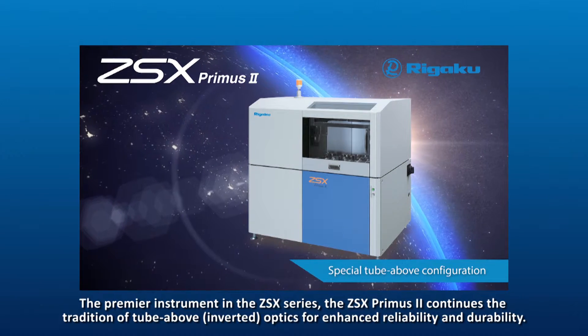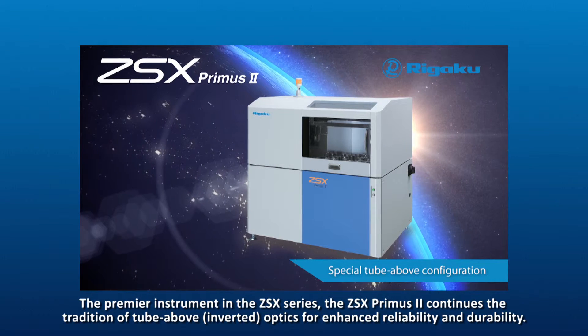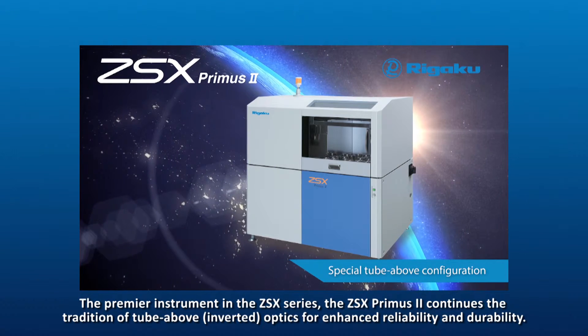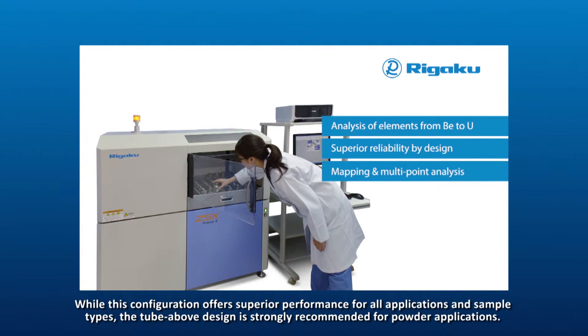The premier instrument in the ZSX series, the ZSX Primus II, continues the tradition of tube above inverted optics for enhanced reliability and durability, offering superior performance for all applications and sample types.